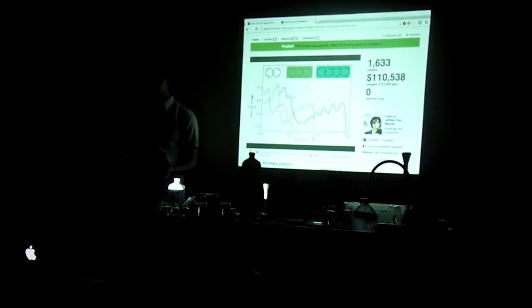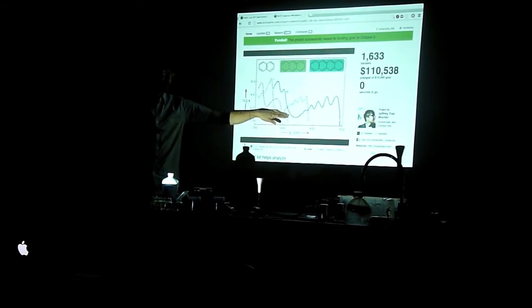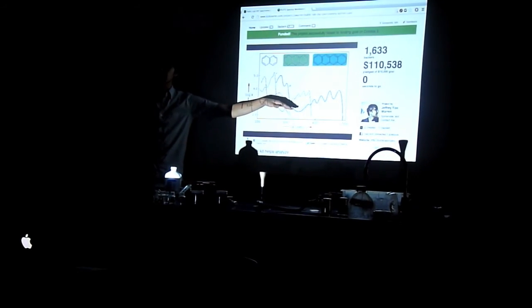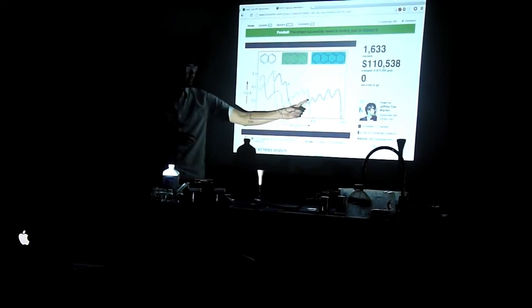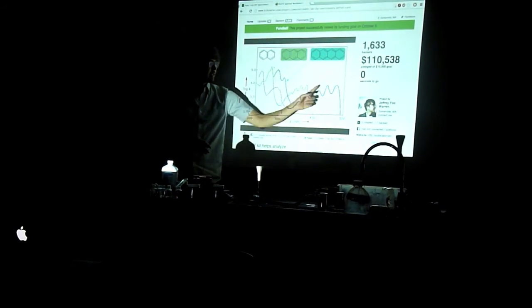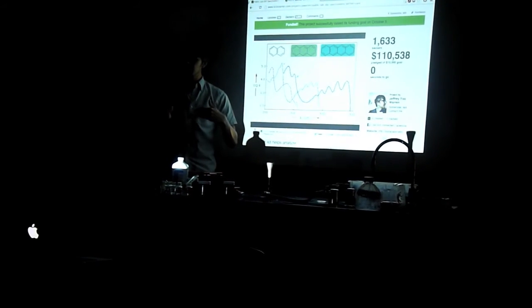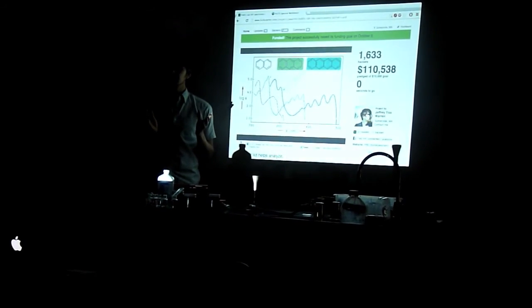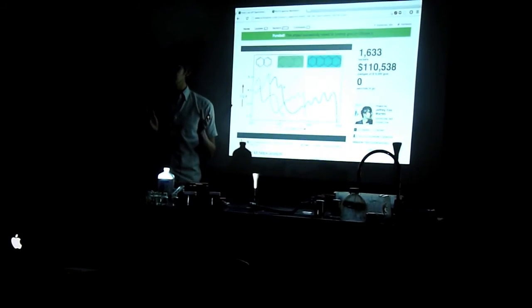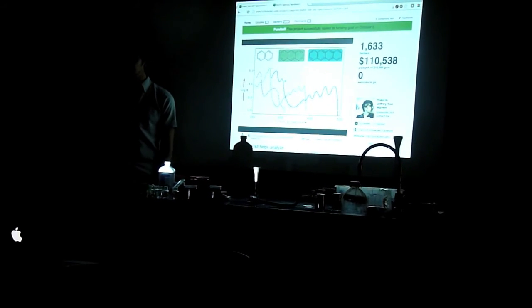The likelihood is actually going to be pretty low, I think, because there are going to be multiple things. They're not going to be separated out like this. They'll be blended together, so you'll get all these different spectra mixing. But if you could see these four distinct little peaks here and pick them out, and you saw them in one sample and not in the other, that would be the dream scenario. We may be years away from that, but that's kind of the entire story. UV is absorbed.